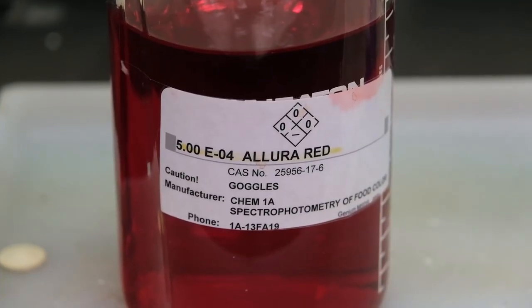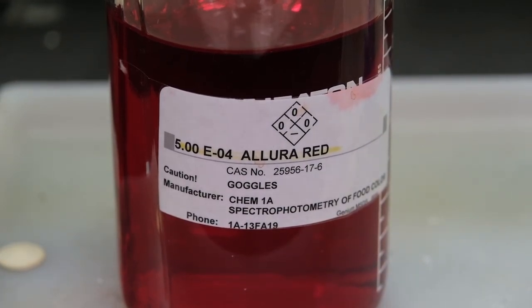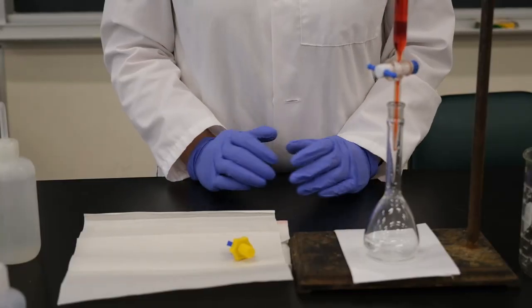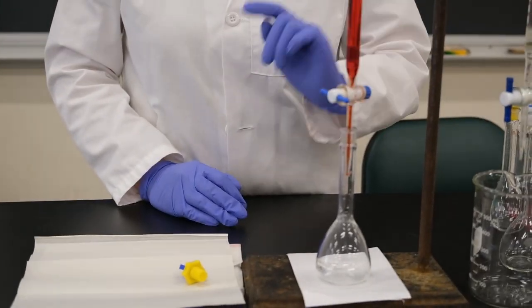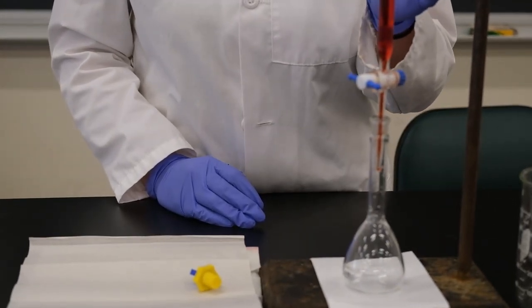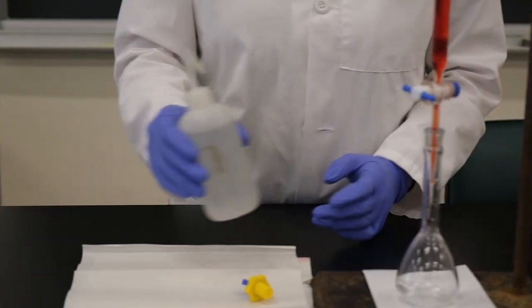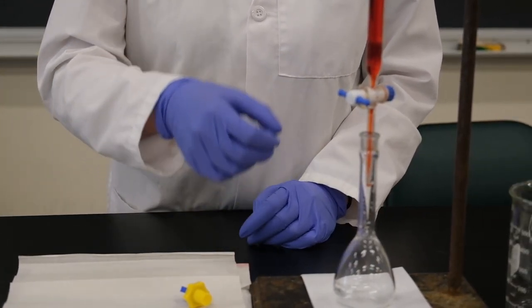This is for experiment 13, and this is the Allura Red dye we're going to be using. So record the molarity to the correct number of significant figures. We're going to be making a dilution of Allura Red. We're going to be using 8 milliliters of the Allura Red, measured with the burette into the 100 milliliter volumetric flask. After we've added it, we're going to add some deionized water to the 100 milliliter mark.